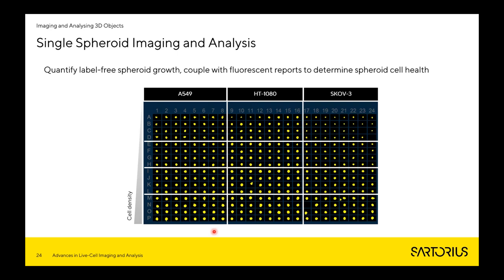Bright field is much better designed for imaging three-dimensional objects because there is already contrast there. Phase contrast works brilliantly for flat structures where contrast needs to be added, but when you already have contrast, bright field gives a more consistent approach.